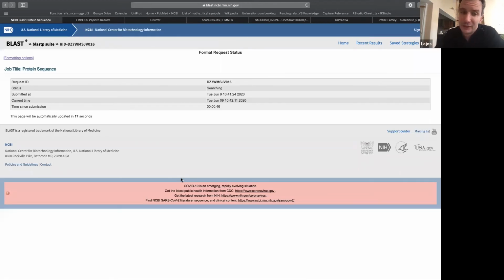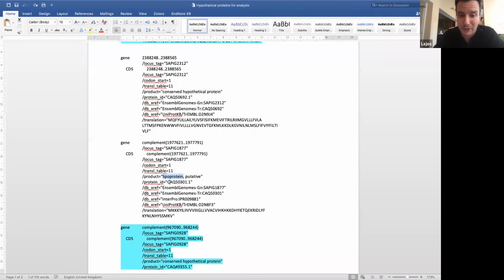So again, you have to be very careful if something like this is written here. That doesn't mean that it's actually a traditional or real lipoprotein. Maybe it's just a membrane protein, which I think much more should be called a membrane or transmembrane protein.